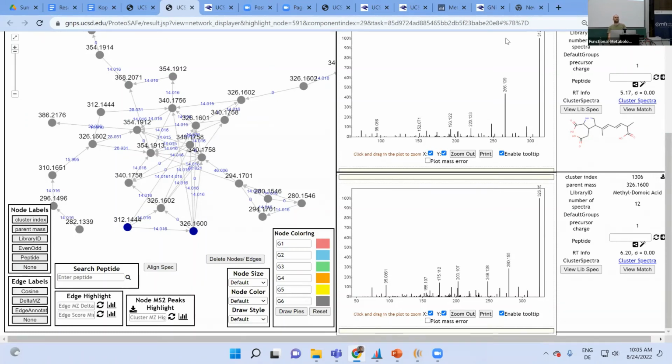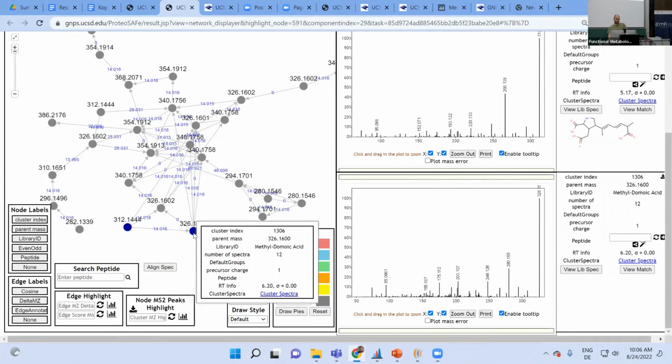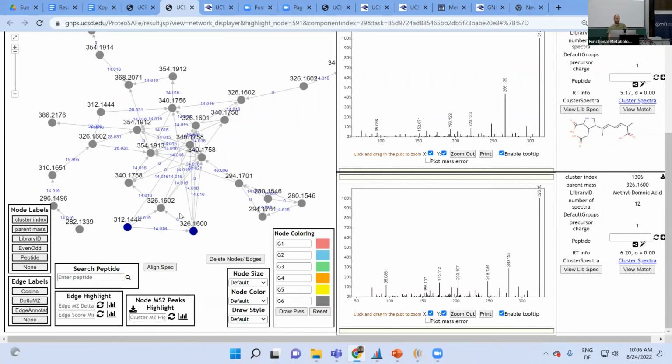Yeah, another question? I have two questions. One is about substructure in GNPS, and the second is, can we locate in which sample this compound is? Yes. So for feature-based molecular networking, right here out of the network view, there is not. If you do classic molecular networking, you can, because you can subdivide this into these default groups here, and then you can label which group it came from.